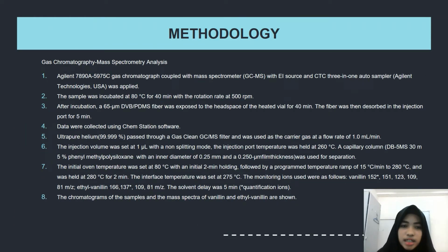So this is the explanation about gas chromatography mass spectrometry analysis.